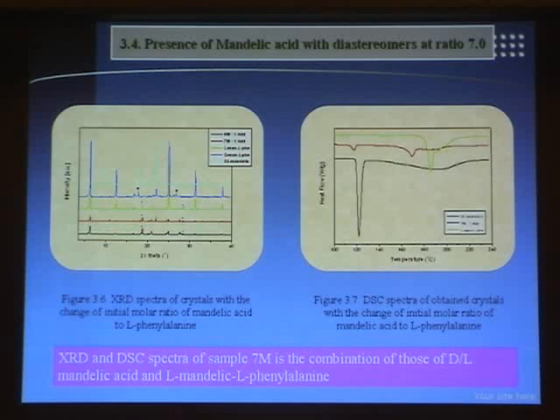And this result can be confirmed by using the DSC machine to measure the melting point. You can see here this peak is very close to the melting point of DL-mandelic acid, and this peak is similar to the melting point of diastereomeric LL. However, it's a little shifted because of the effect of D-mandelic acid on the diastereomeric melting point.